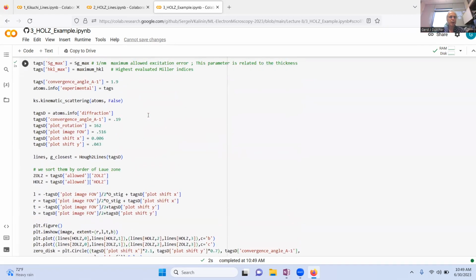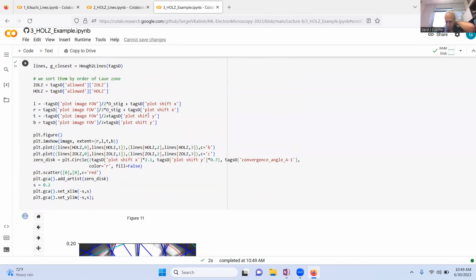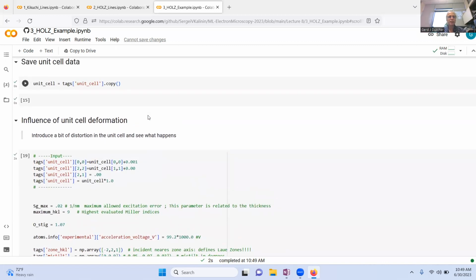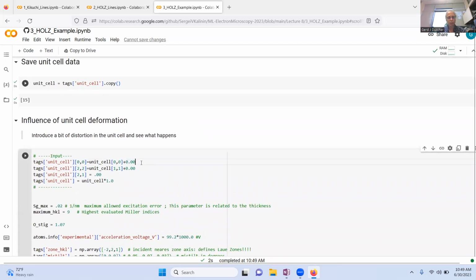So we had in the order of 1 picometer in the image for the plane strain to be determined. Here we have now the accuracy of tenths of a picometer, and we have it here in the planar strain. Let's see in the third dimension.